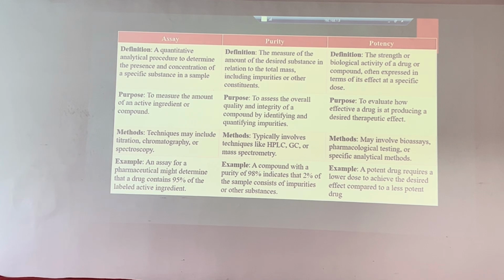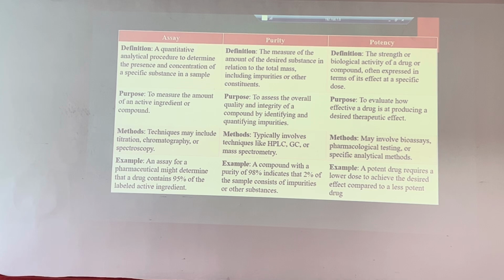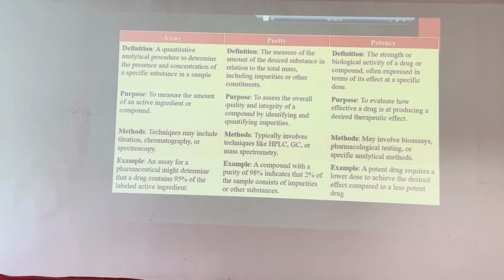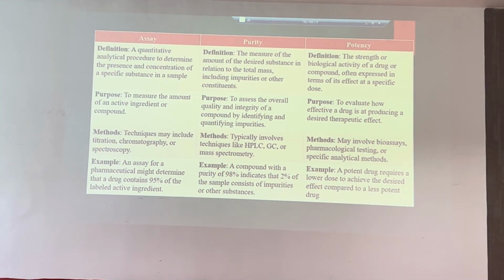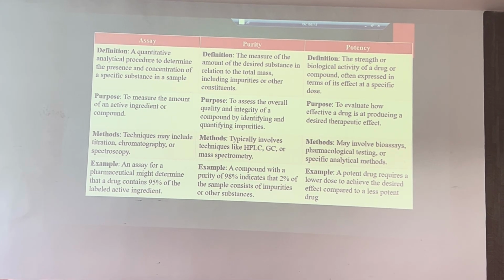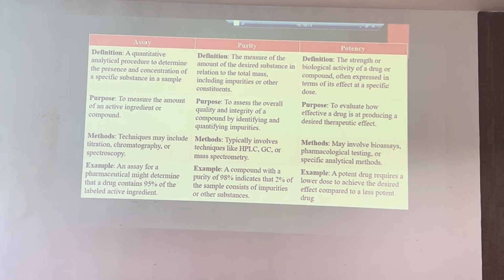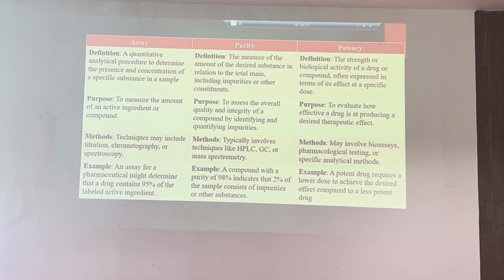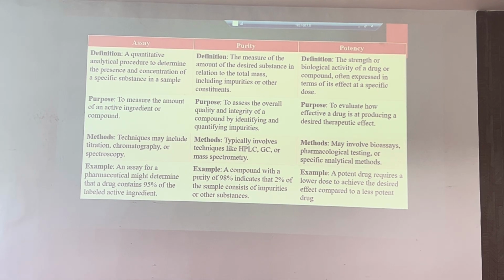If it is a dried basis, what we can do is, whatever the volatile substances, while drying by doing the LOD at the normal 105 degrees centigrade or vacuum temperature, you can evaporate whatever the solvents which are present in the molecule. That is called dried basis. If it is an anhydrous basis, whatever the moisture which is present in the molecule, we can remove through the KF test or KF coulometer, with the relevant techniques. Now you got the difference. Next.